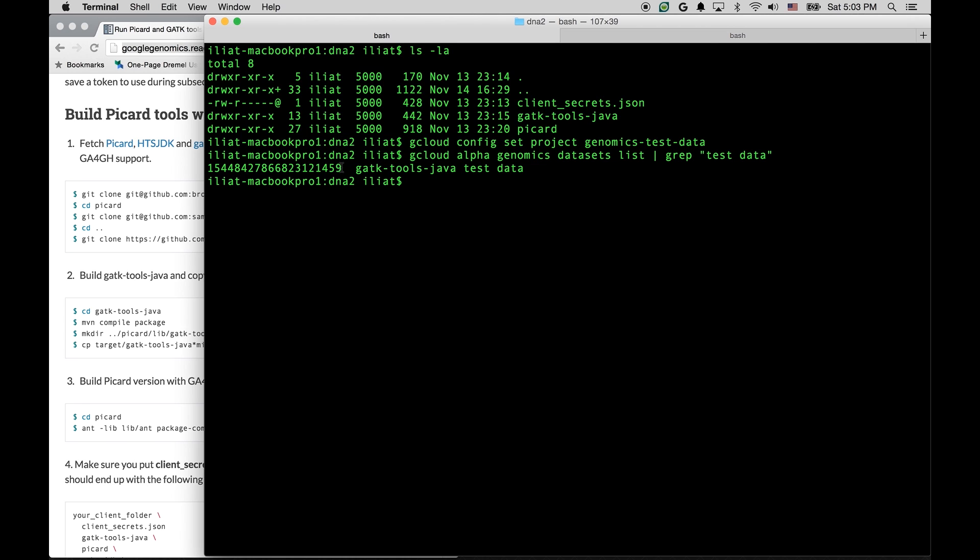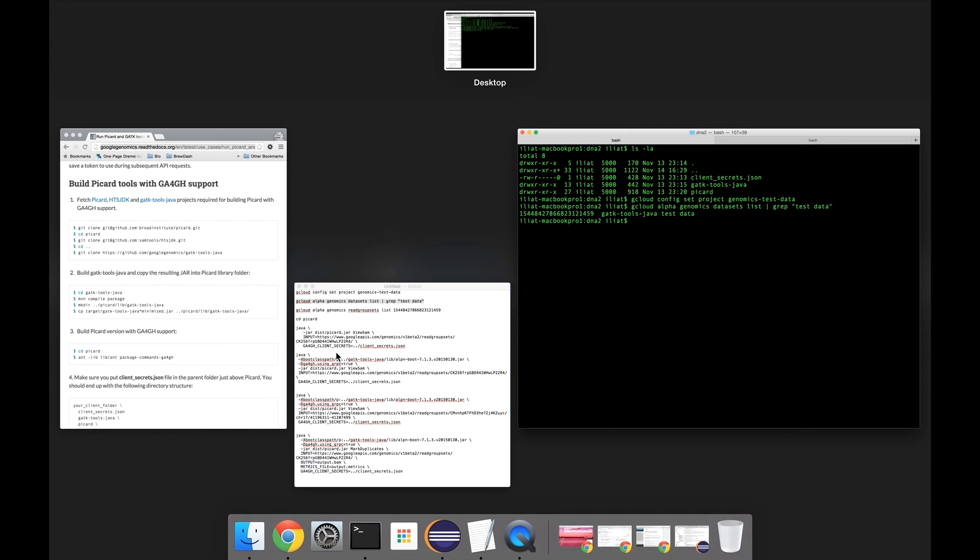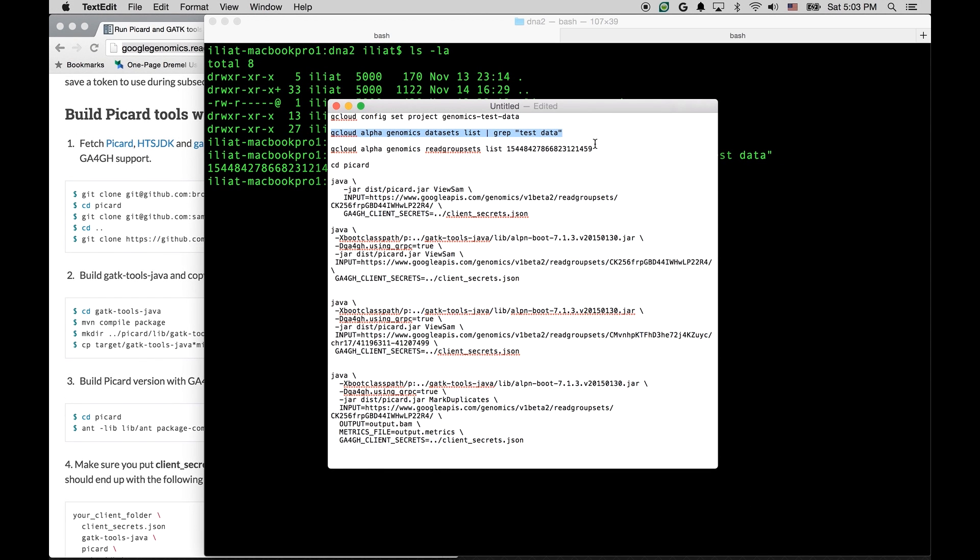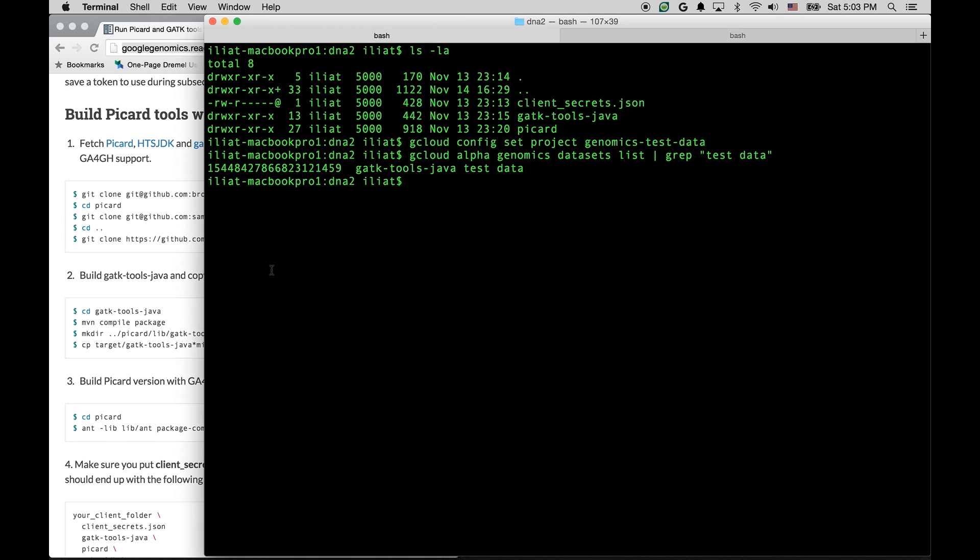Now, we're going to find the read group sets that we want to access. Read group sets can be roughly thought of as corresponding to BAM files. So again, we are running a Genomics API command, this time to list read group sets that are under the dataset that we found in the previous step.